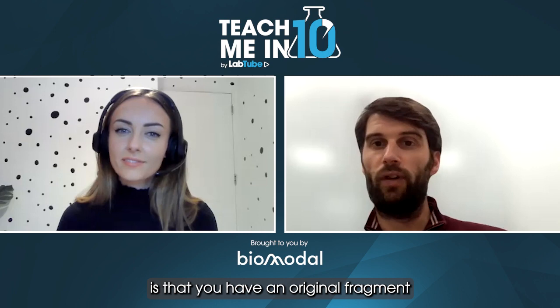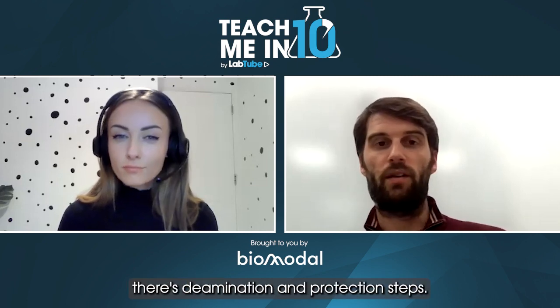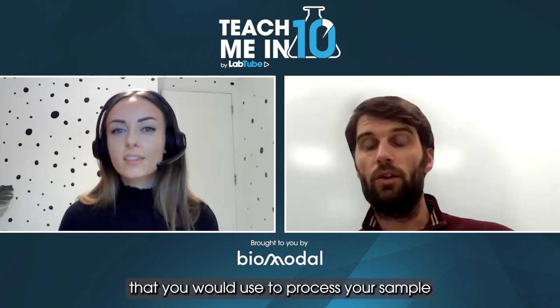Now, the core concept of the workflow is that you have an original fragment to which you append a hairpin, you have a copy step, and then there are some differential enzymatic steps. There's methyltransferase, there's deamination and protection steps, that give you a different context across the CpG and across the DNA duplex, that allows you to derive either an unmodified cytosine, a methyl cytosine, or a hydroxymethyl cytosine. And it's that molecular biological logic that is resolved in the pipeline that you would use to process your sample and produce the 6-base genome.